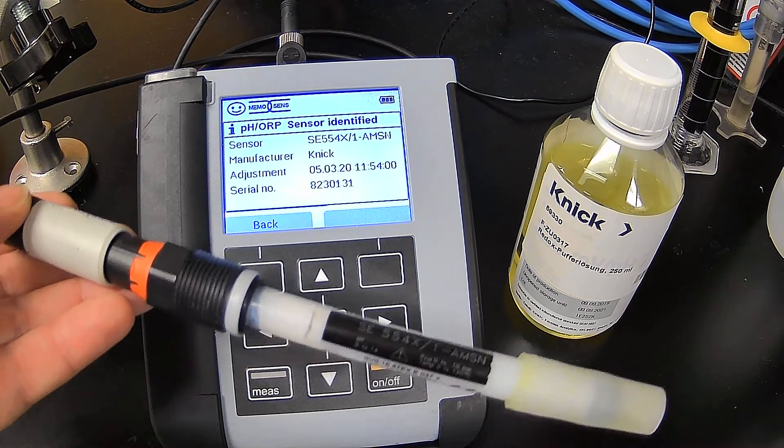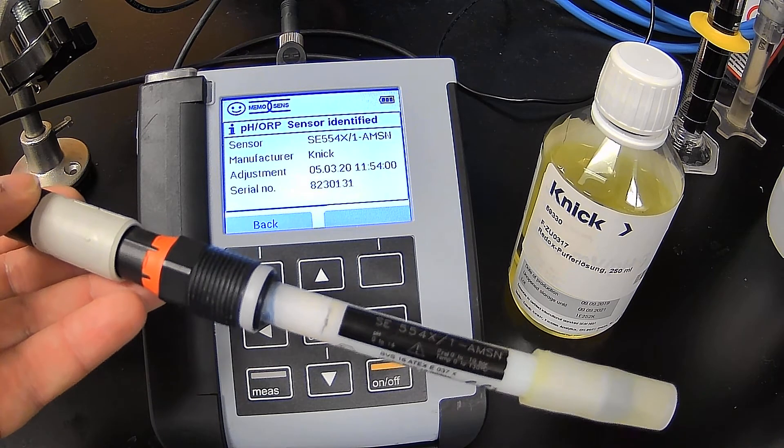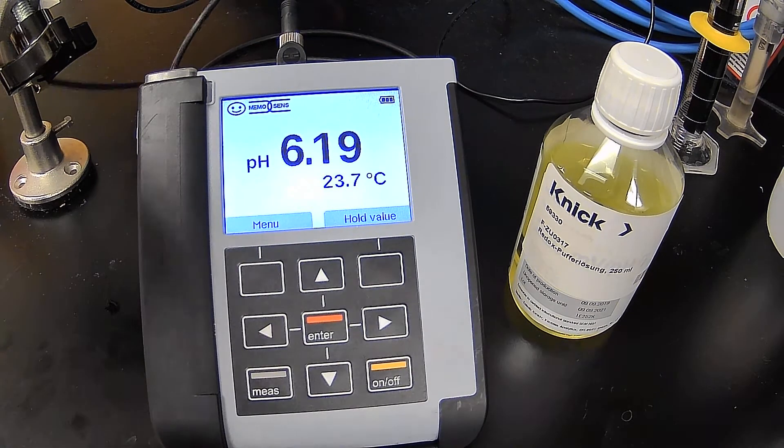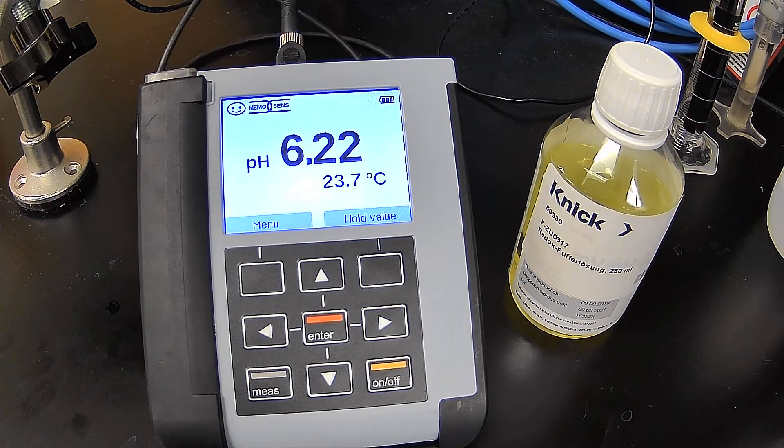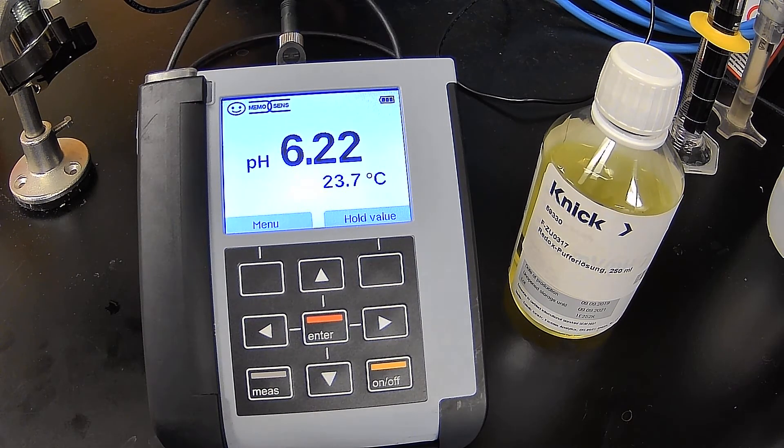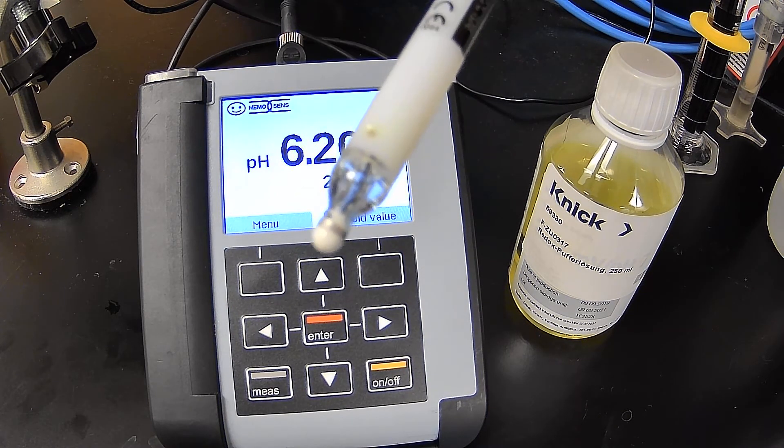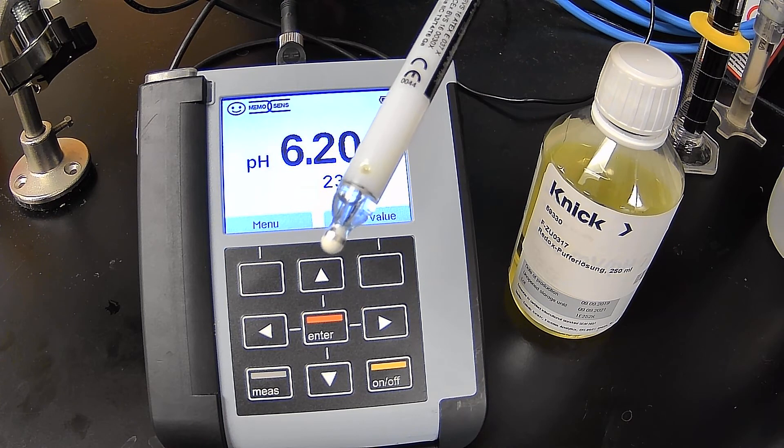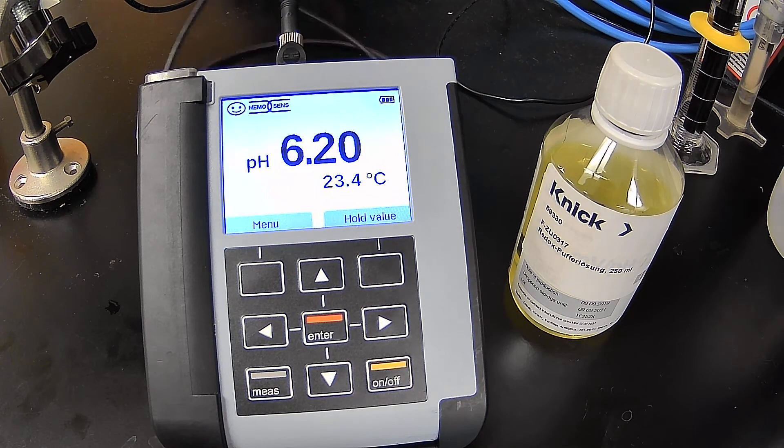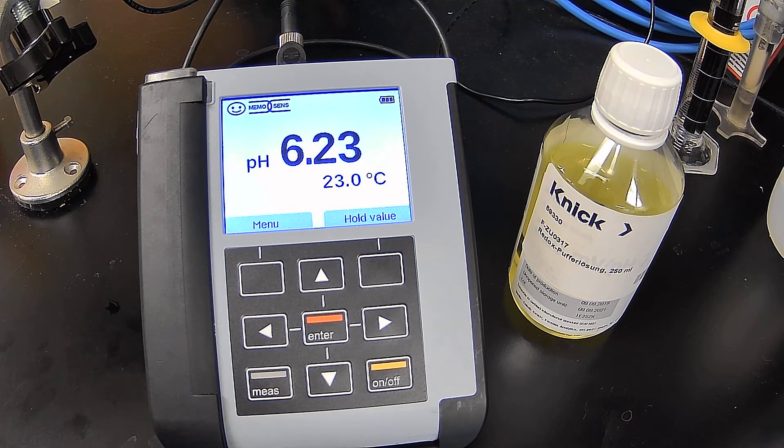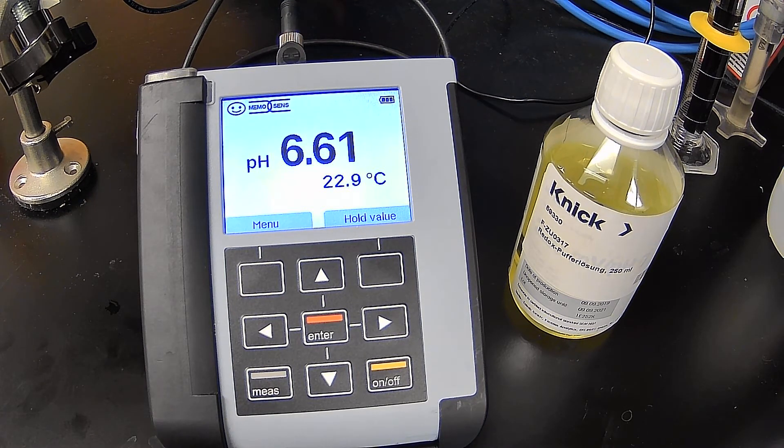So when you make that connection, you get the serial number, you get the last calibration, manufacturer, all that good information. So I'm going to remove the wetting cap that's on there, and because this is a combo probe, it does ORP and pH at the same time. I'm going to put it into the buffer here, or the calibration solution.